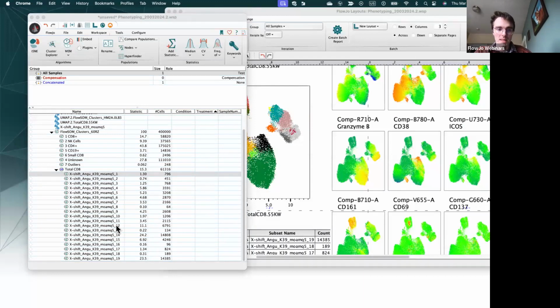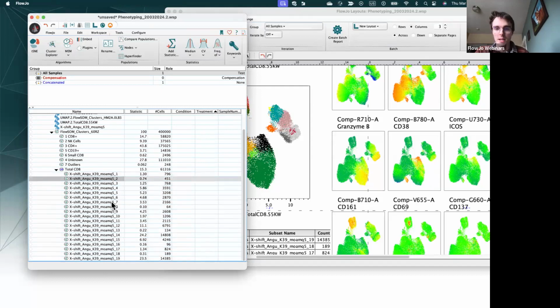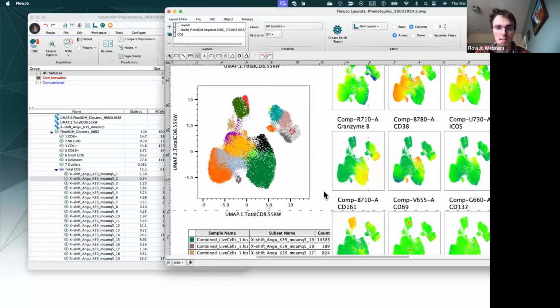Okay, the last thing that I wanted to show was MEM. Let's go ahead and do that. I'm looking at my checklist, and I think we've covered most everything else. I haven't really renamed any of these populations yet. Maybe I should do that just to demonstrate.